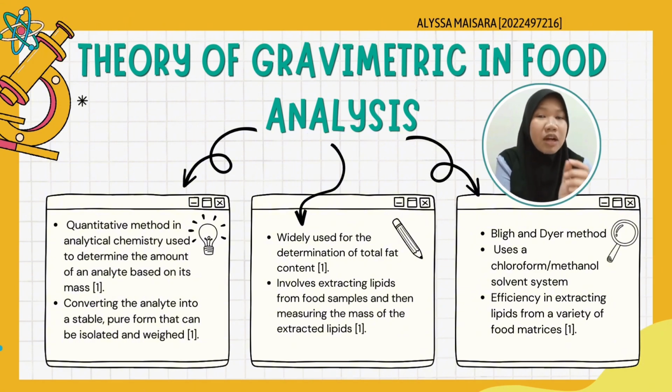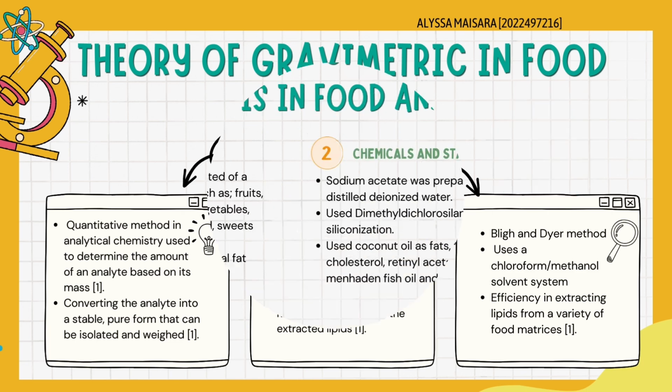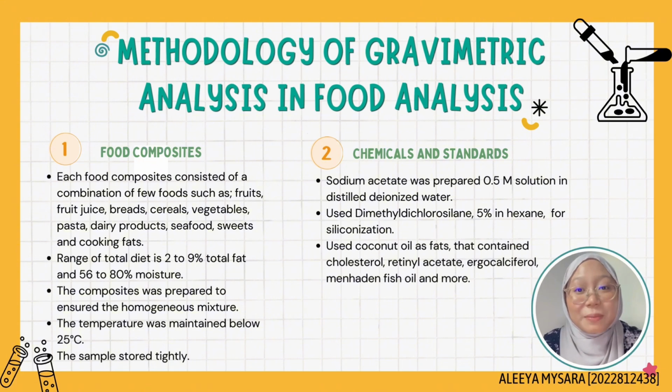Gravimetric analysis remains a fundamental technique in food analysis, providing essential data for ensuring the quality and safety of food products. Hi, my name is Alia Maisara binti Mustafa Kamal, and now let's move on to the methodology.